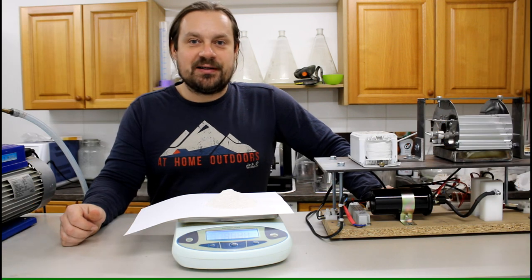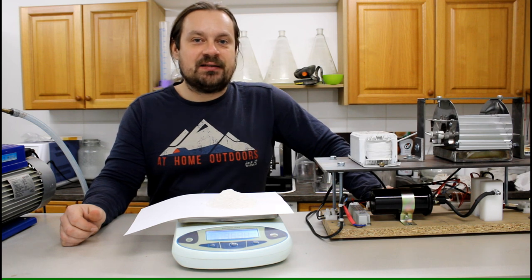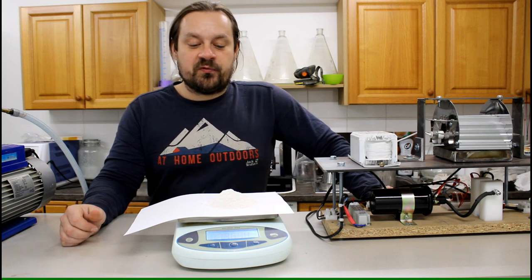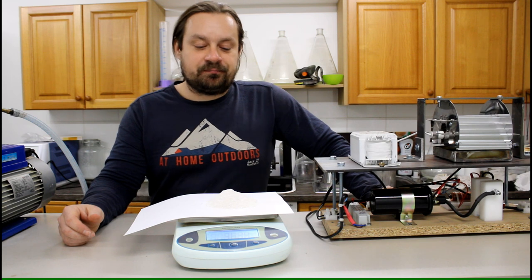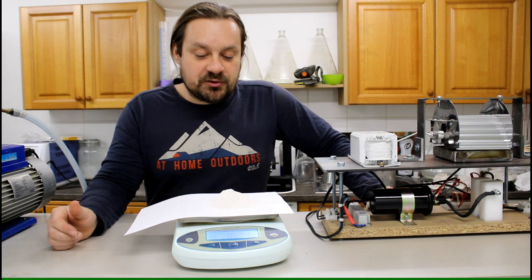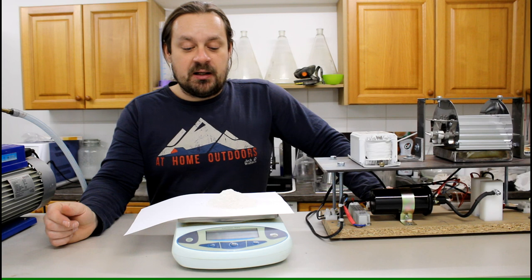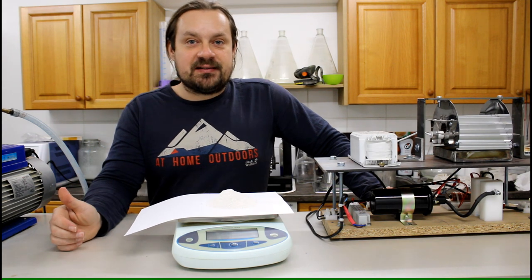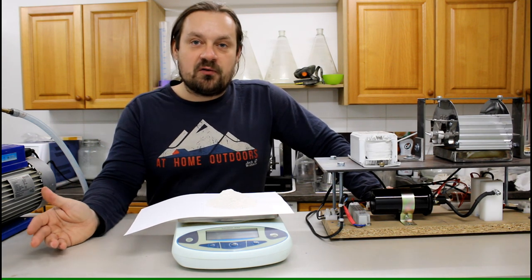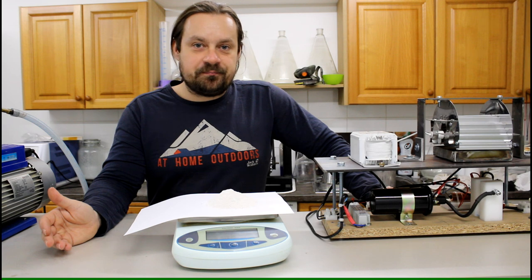Finally, the powder is dry, and we have a yield of about 36 grams. So if you remember, we started with 800 grams of ore, and now we are having an extract of the ore of about 36 grams. The powder that you see here, it's not totally white, it's a little bit white to very slightly brownish. But this doesn't matter. And what we are having here is more or less a hydroxide precipitate of various metals occurring in that particular ore that I processed.